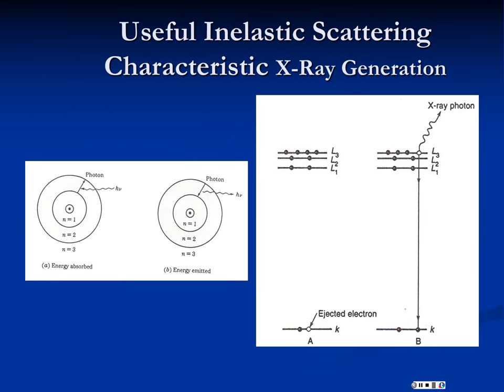So, okay, so that's Bremsstrahlung. That's not useful. So the heat is potentially useful. We do use electron beams for welding. And in processes, you can ask your professor about electron beam welding. That's pretty cool. We have a lot of useful inelastic particles or inelastic scattering events, though. And the first of these is called a characteristic X-ray. So we're going to get another kind of X-ray, but this one is actually helpful.